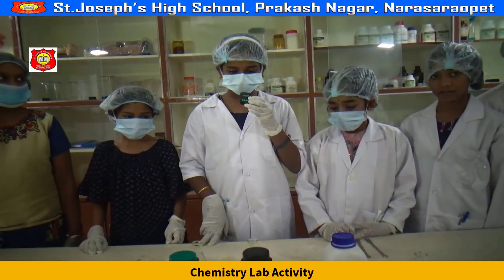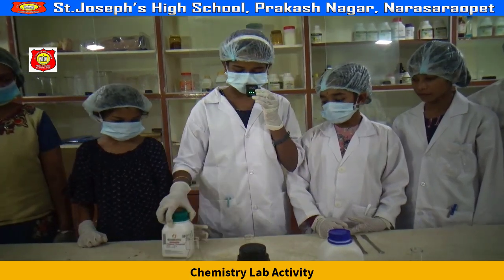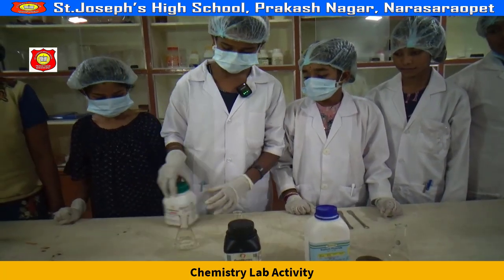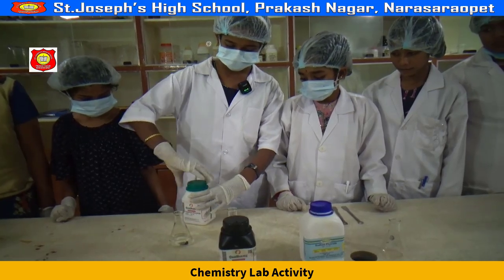At first, I'm going to mix potassium thiocyanate. I'm going to add potassium thiocyanate into this beaker.